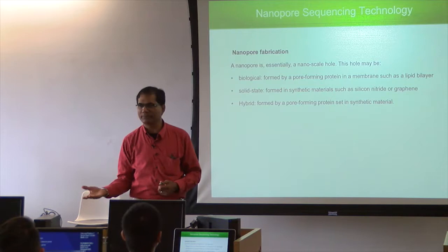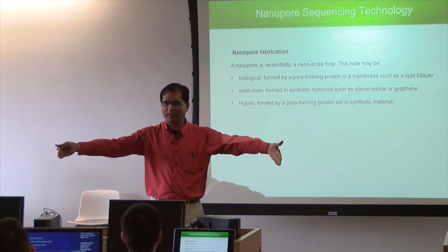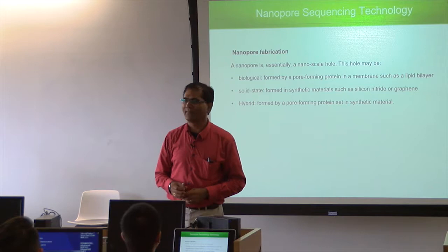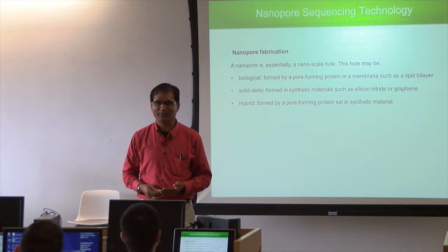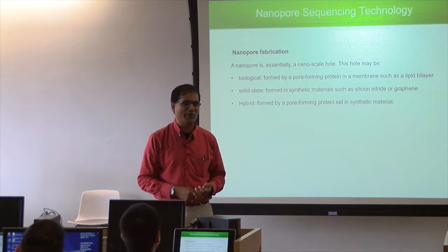So the idea was, can we develop a synthetic nanopore using a lipid bilayer synthetically, and then take a long DNA and push it through that pore, like a thread? As each nucleotide comes out, somehow detect that nucleotide and then build a sequence. How do you like this idea? You can pull 20, 30, 40 kb, even an entire chromosome, as long as you are detecting each nucleotide as it comes out.